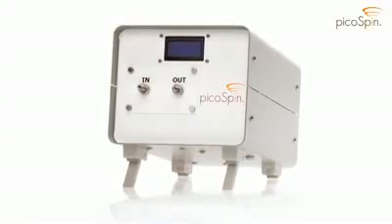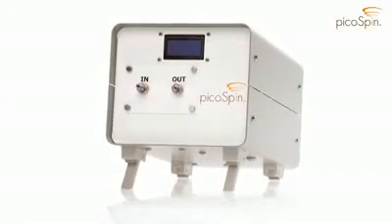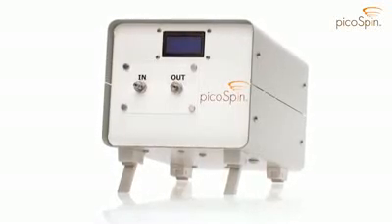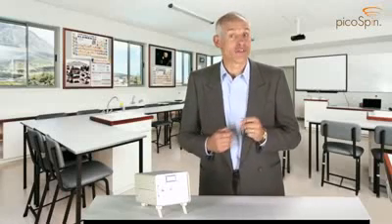We've made it small, inexpensive, and powerful, so your students can have direct access to NMR in the classroom and laboratory. Let me highlight for you some of the outstanding features of the PicoSpin45 spectrometer.